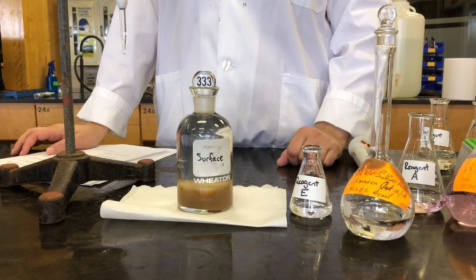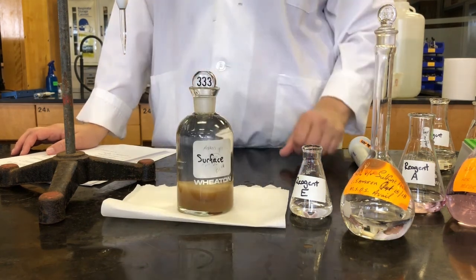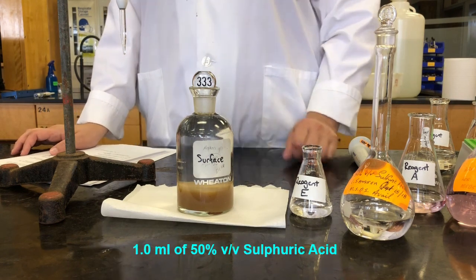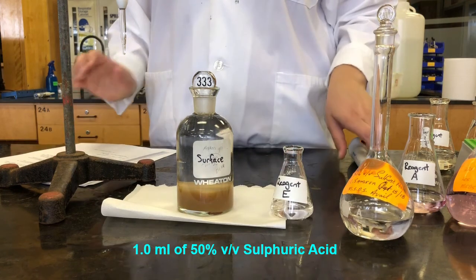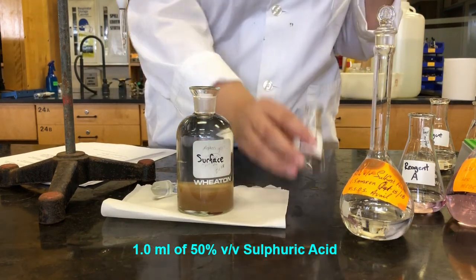Okay, so we've allowed our sample to sit for a few minutes to allow the precipitate to settle to the bottom. So you should be able to see a brown precipitate there at the bottom of the flask. So now we're going to acidify it. So we're going to add reagent E, which is sulfuric acid. So it's 50% sulfuric acid, which is reagent E. So we're going to add 1 milliliter of that to our flask.